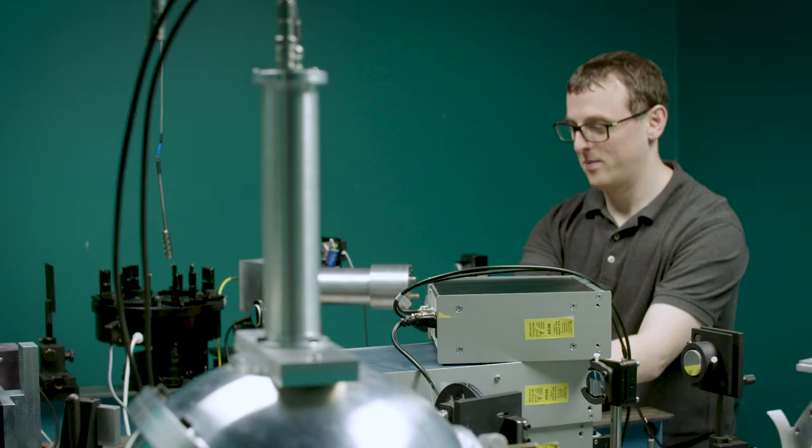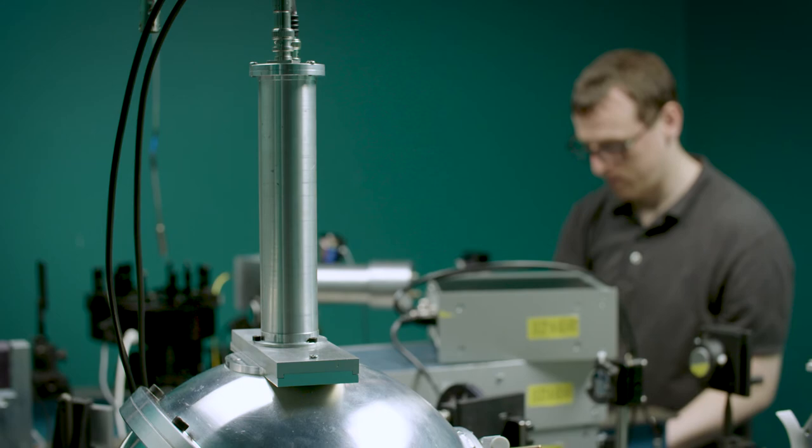If you are more interested in the total reflectance of a sample you can use an integrating sphere to measure for example six degrees diffuse reflectance. That is six degrees incidence and diffuse viewing.